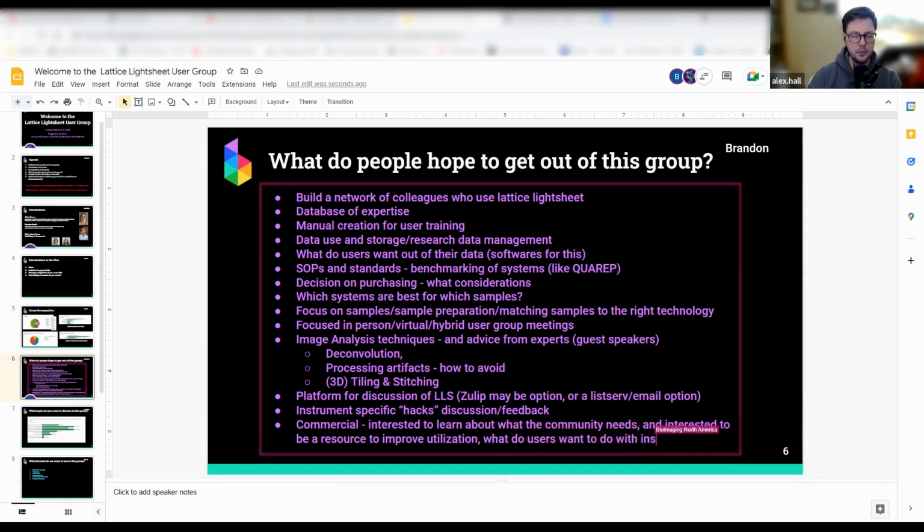Again, on the software side of things, I'm also in listening mode to see what kinds of analyses people expect. Working with huge amounts of data is challenging, right? It's technical to do the sample prep, it's technical to assemble the microscopes, and it's technical to run the microscopes.